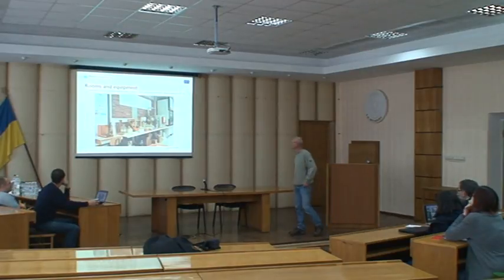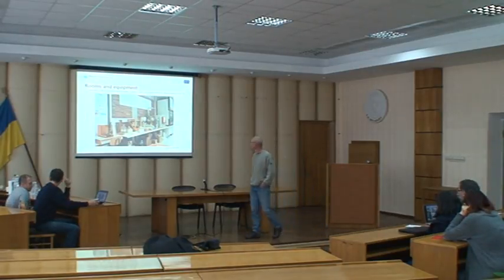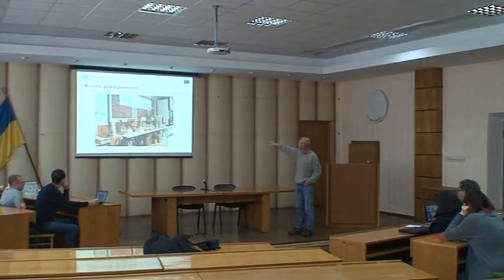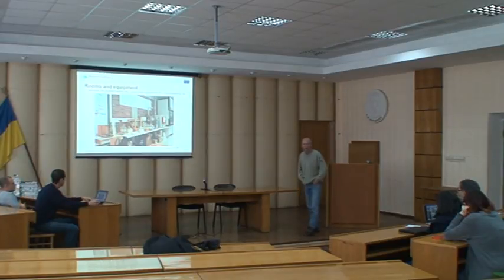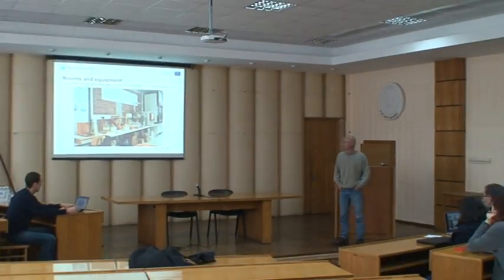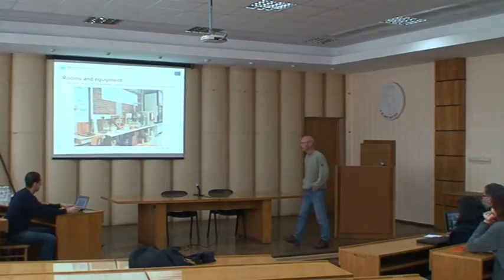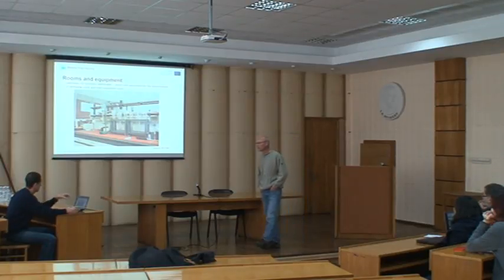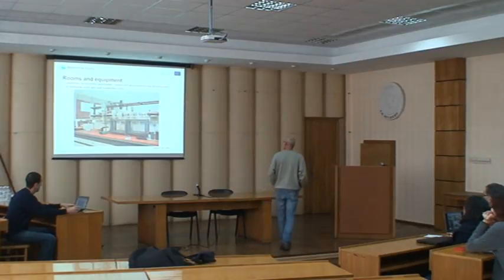So this is a laboratory for domestic wastewater. You can see all the equipment, the balances, and the desiccators, the oven, and every equipment for the determination of the total suspended solids, which are needed. Okay. And here we have some equipment for settleable solids, which is a parameter of domestic wastewater and total suspended solids.